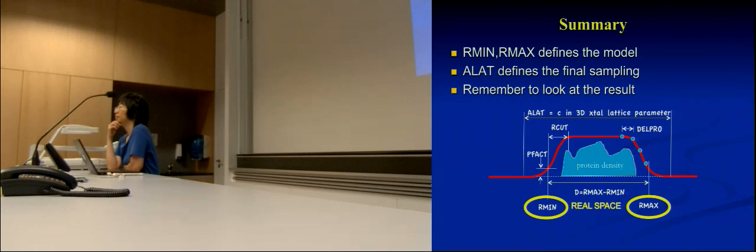When you make your first reconstruction, you do it in the P1 symmetry, right? You don't apply symmetry, or do you? Or can you use a symmetry after that to estimate how good the data are? You can use, let's say you don't know your symmetry, and you are not sure at all, you want to use P1 to process all the time, then you can look at your lattice line.